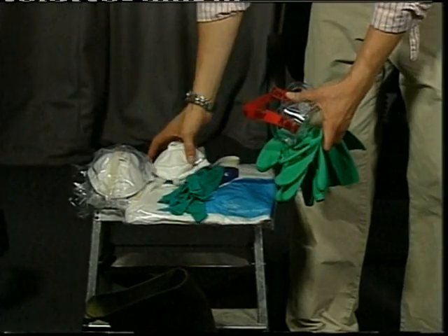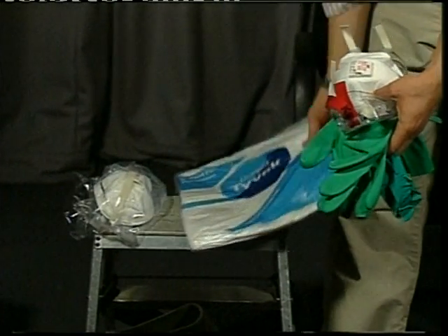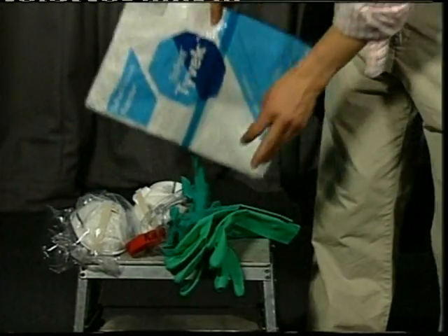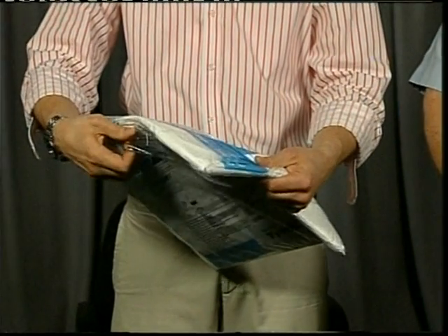This morning we're going to run through the donning and doffing of protective clothing similar to what you would use in an incident for avian flu. What we have here in the kit is a one-piece coverall, goggles, two pairs of gloves, a respirator, and a pair of footwear or rubber boots.